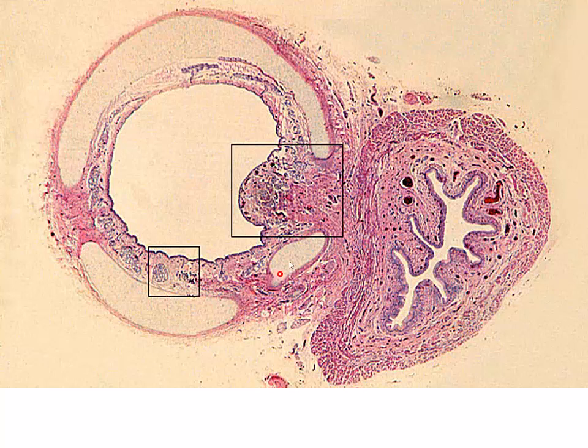Now, even at this low magnification, we can pretty much guess that we're looking at cartilaginous rings. We have our mucosal lining. We're going to have our glandular material here in the submucosa. And then when we look at this area between the arms of the cartilage, this is going to be the area where we see our trachealis muscle. And so we're going to focus on this area.